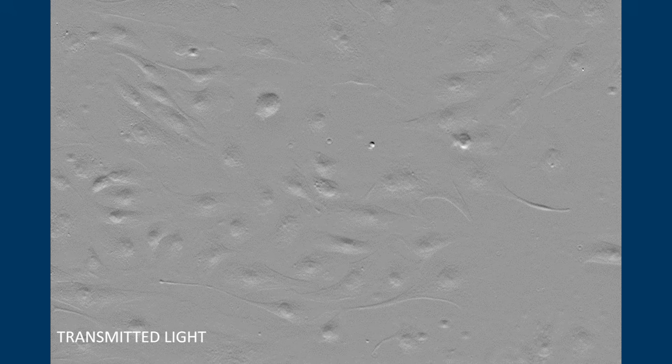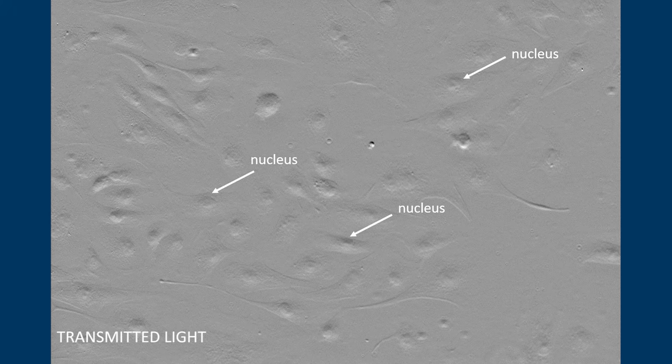So let's take a transmitted light image of these cells here. In our transmitted light image we can see our cells and we can even see some subcellular structures like the nucleus.